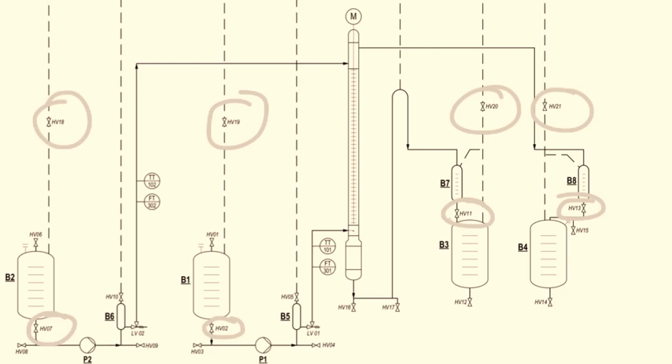The next step is to switch on pump number 1. When we switch on pump number 1, we allow the solvent — pure toluene, which is the light phase — to flow into the column. We need to watch the interface level that forms between the light and heavy phases, and maintain it at 100 cm above the solvent inlet by adjusting the height of the overflow tube, which is the U-shaped tube.